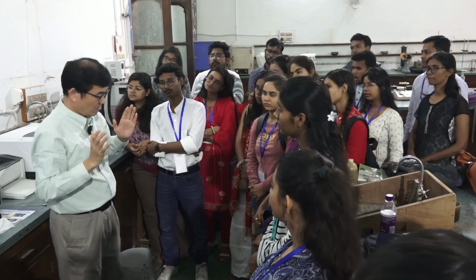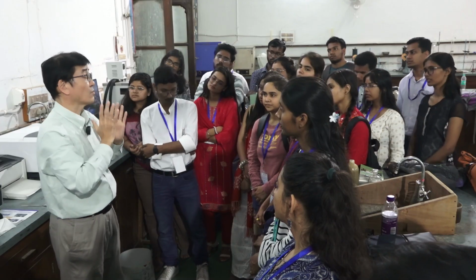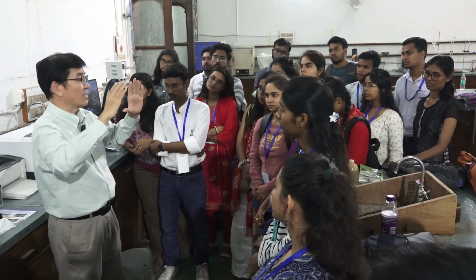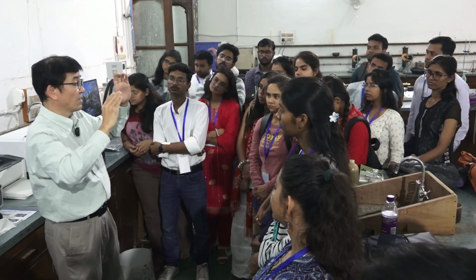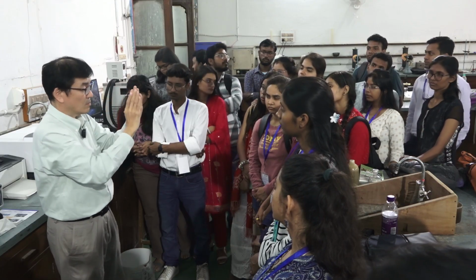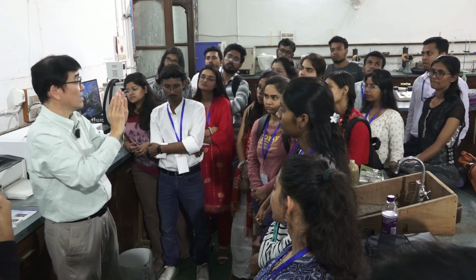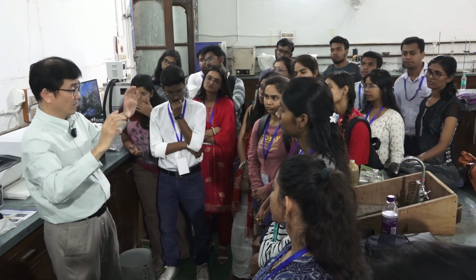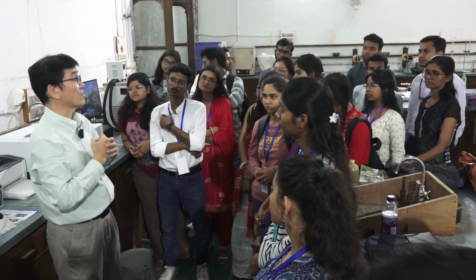So when we compare the ATR IR spectrum and the IR absorption spectrum in the transmission configuration, some intensity pattern is distorted because of the difference in path length. So we need to be aware of that feature. In a small region that effect may be nearly negligible, but if you show the whole range, you should consider that character.